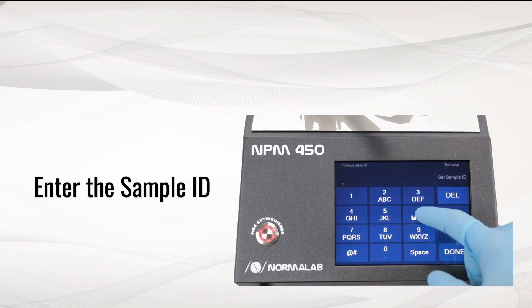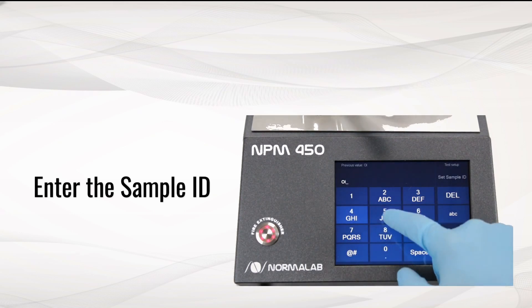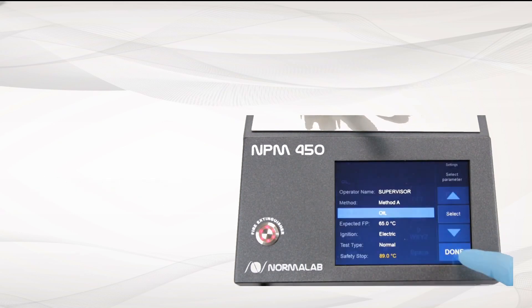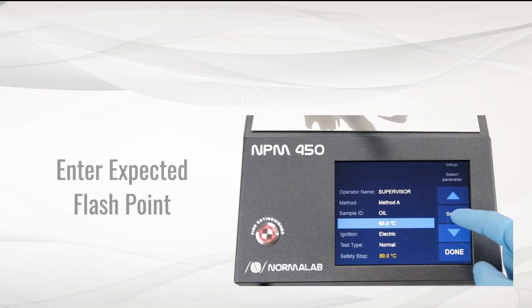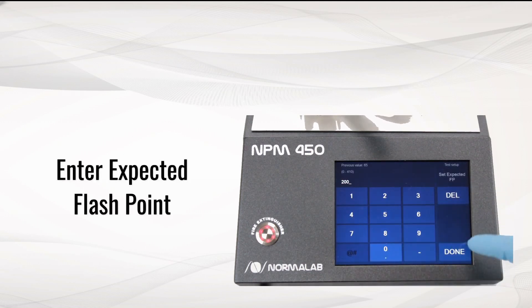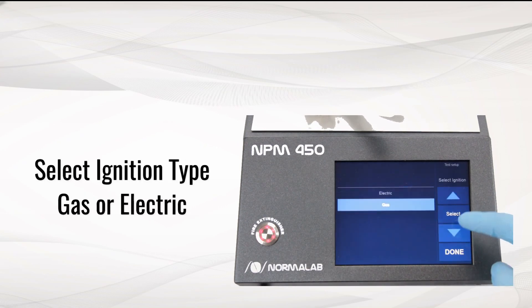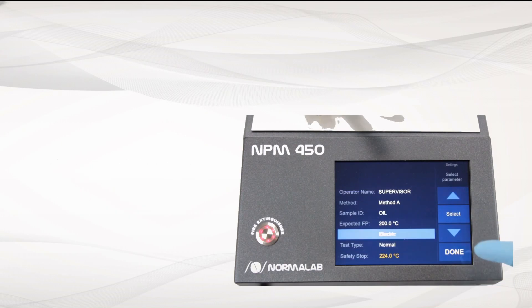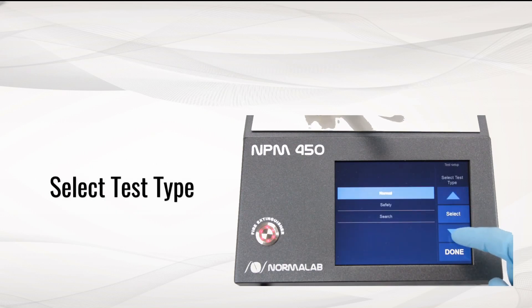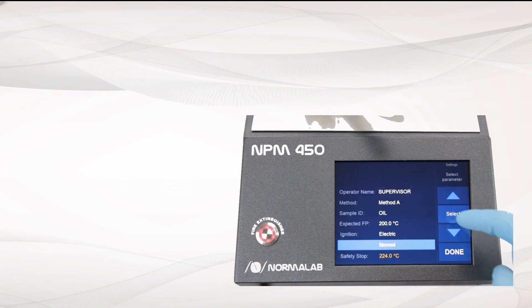Enter your sample ID. Enter the sample expected flash point. Select the ignition input type for the test between gas and electric. Select the test process: normal, safety, or search mode.